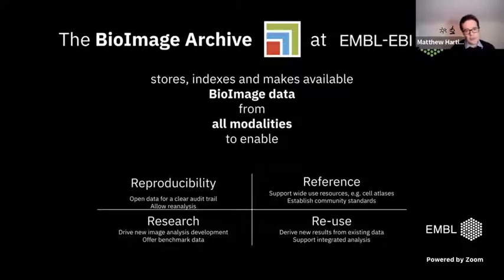Sometimes that's just baseline benchmark data, but particularly deep learning AI techniques really need large corpuses of well annotated reference data, particularly if you want to, for example, train new models. And having a platform that can host those is therefore pretty important for helping to drive the development of image analysis techniques.